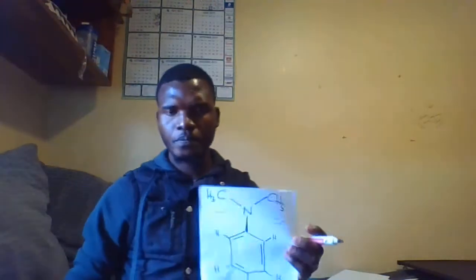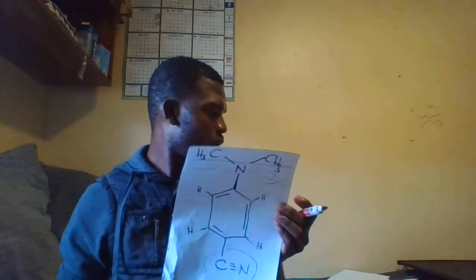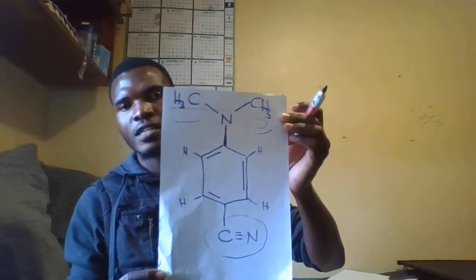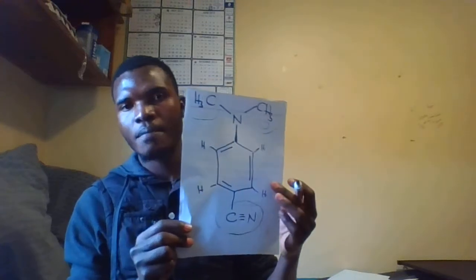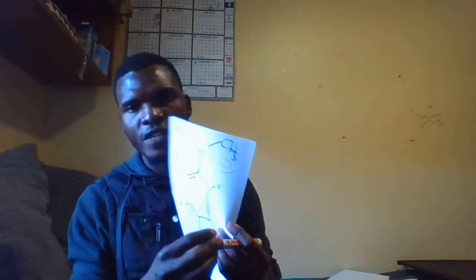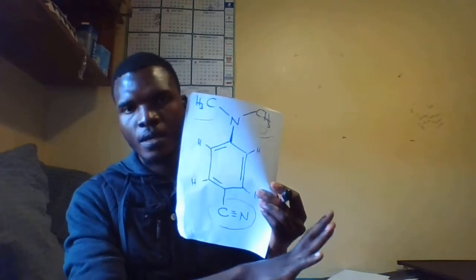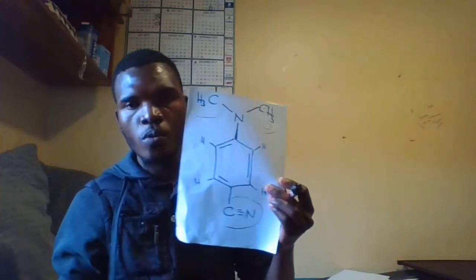Unfortunately I did this in parts so that you can follow bit by bit. So this is the structure that I came up with, which is actually convincing. Normally the challenge is on putting things together. This is why I've adopted this simple technique: once you have the pieces of your interpreted data, you can simply Google.